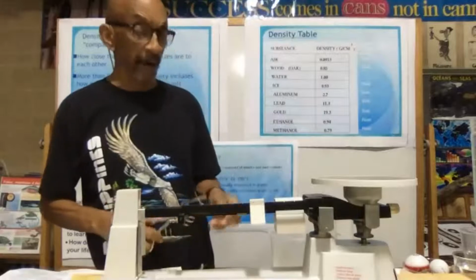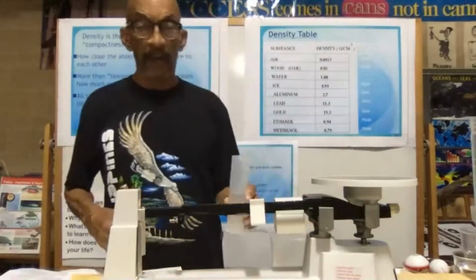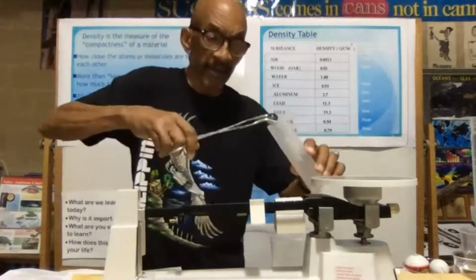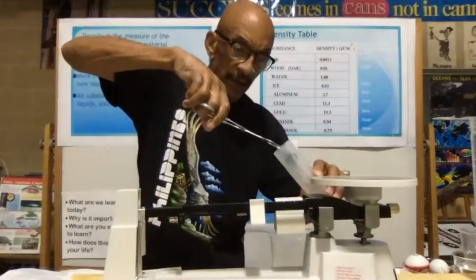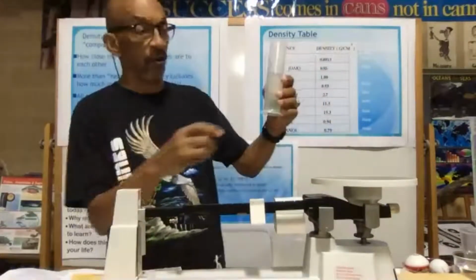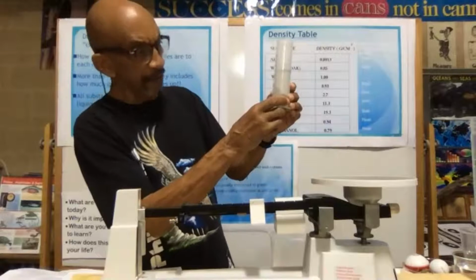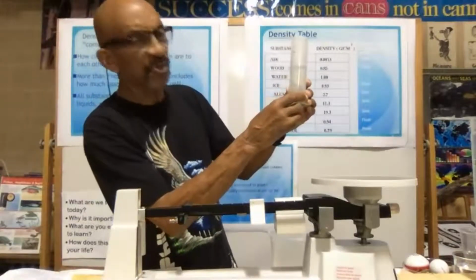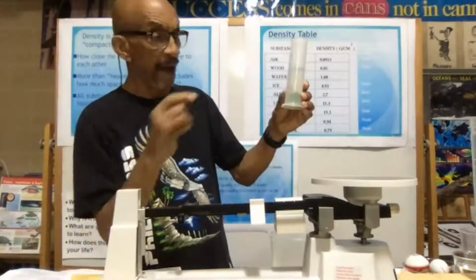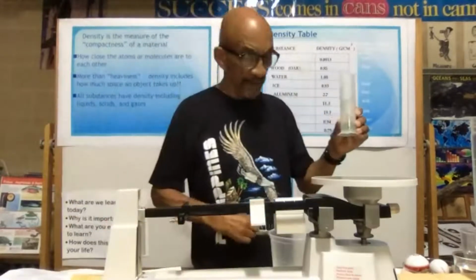Now, another key, you don't want this variable to be in. Whatever object you're going to be putting in the cylinder, you don't want to just drop it in there. You want to be very gentle so you don't splash the water out. So I'm going to tilt this, and I'm going to gently, and I did get a drop. You don't want to do that, but we're going to go on because I don't want to run out of time. And what it's showing me now is 70 milliliters. So the difference between 60 milliliters and 70 milliliters is how much? 10 milliliters. So there you have the volume.